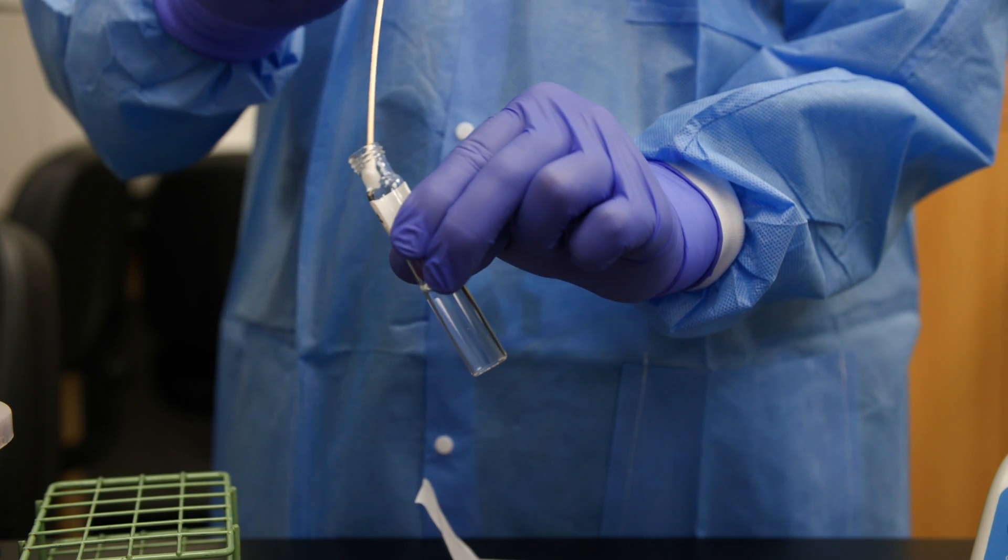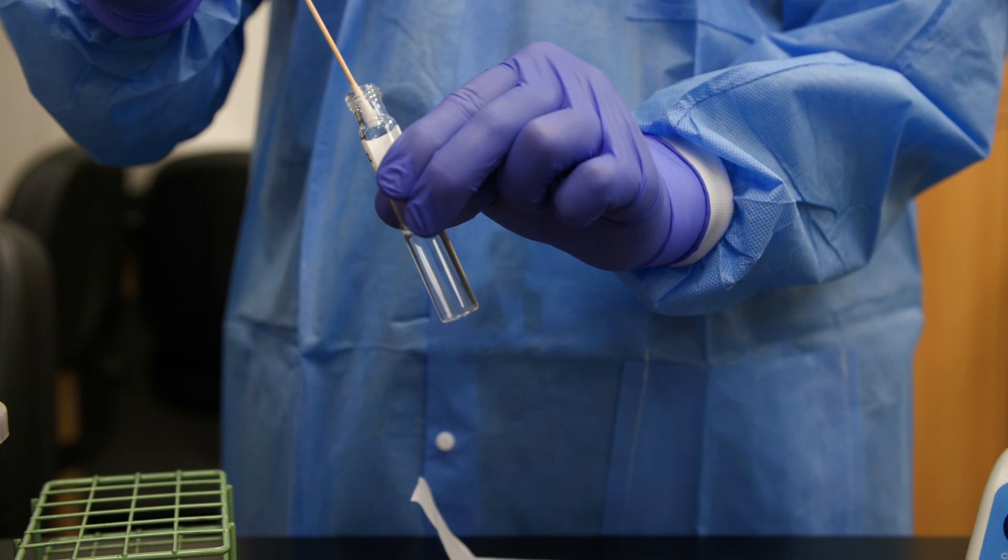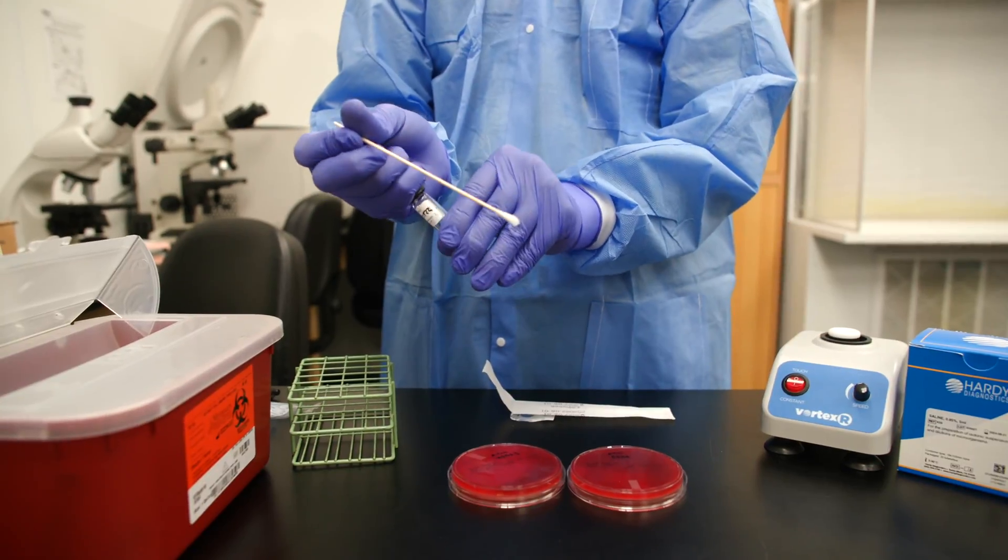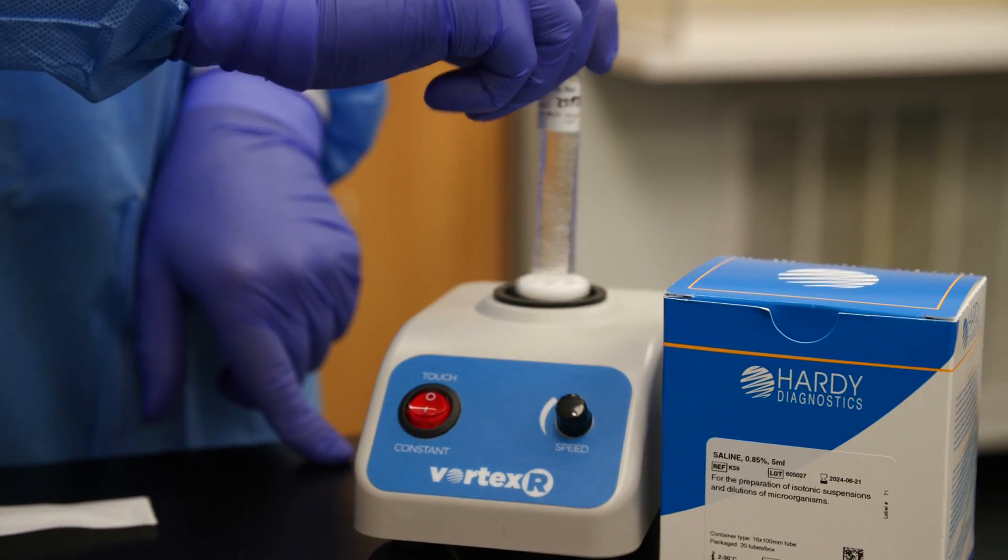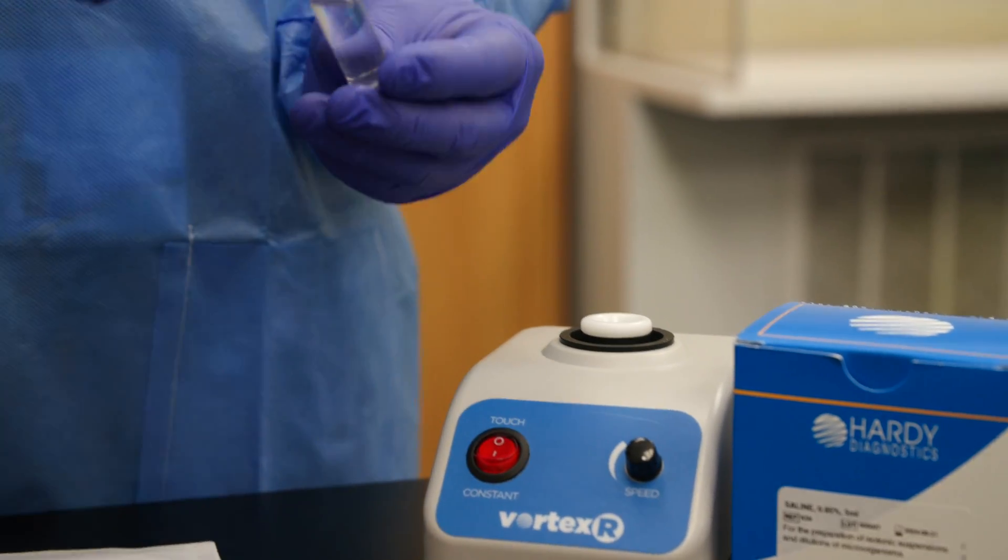Before removing the swab from the tube, press firmly on the inside wall of the tube above the fluid level. This will remove excess fluid from the swab. Firmly secure the cap to the suspension and vortex briefly to homogenize. Gently invert several times if you are not using a vortex mixer.